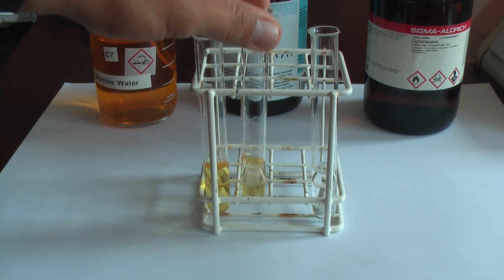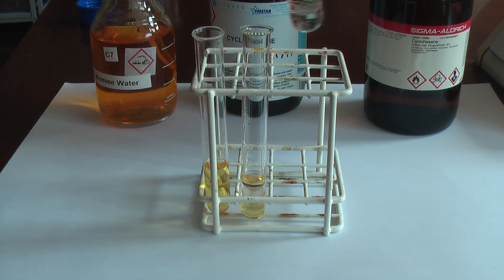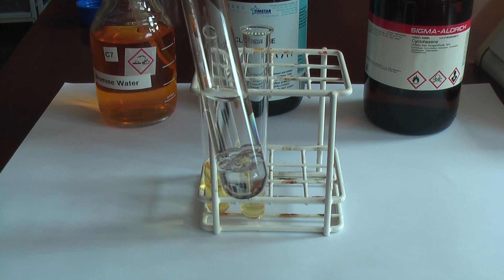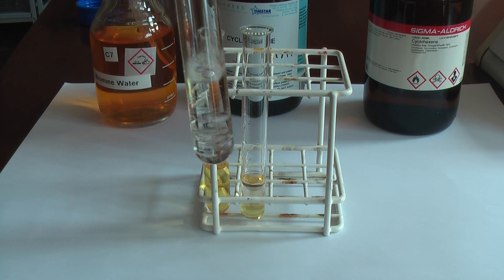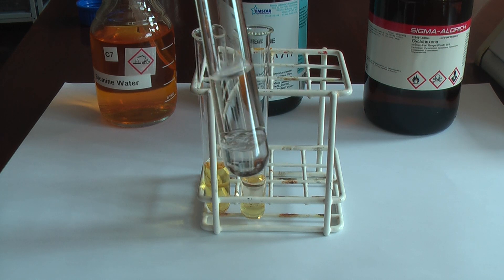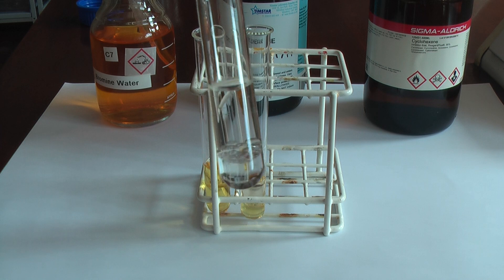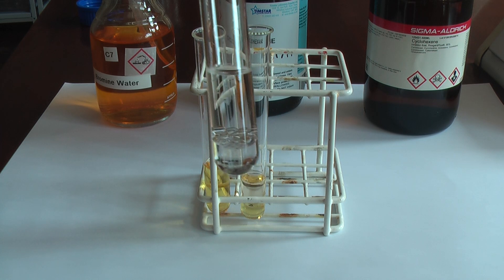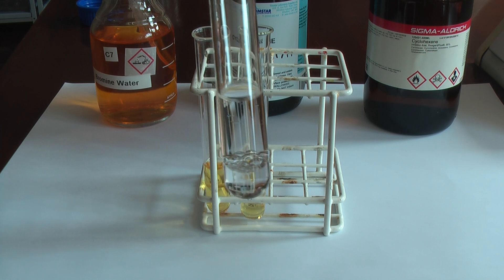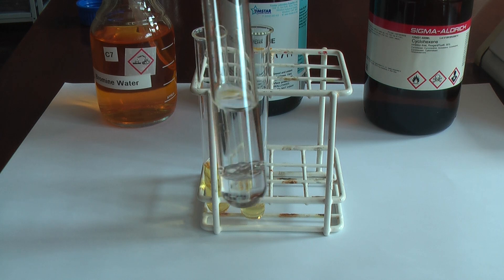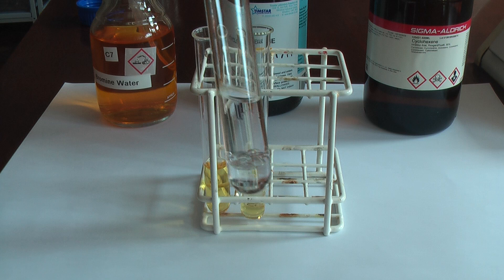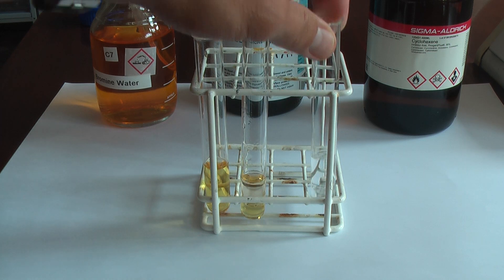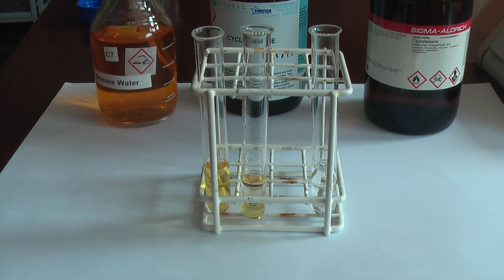With the cyclohexene, I've still got two layers; however, the bottom layer has now completely decolorized because it has reacted with the alkene, and it has now become saturated. Okay, just a very quick demo to show you. Thank you very much.